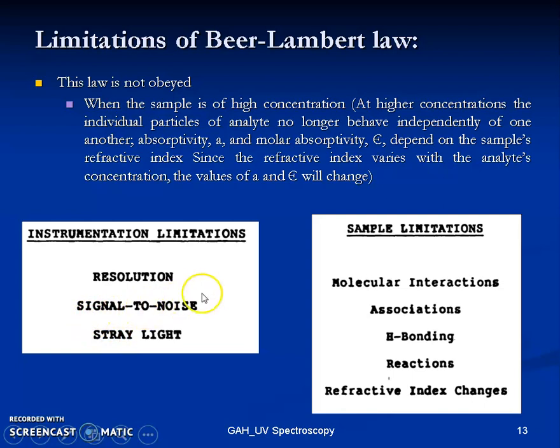Signal to noise ratio is one of the important concepts, wherein we need to differentiate the signal from the background noise. A certain ratio is fixed so that a signal can be taken out from the background noise, where a peak of sufficient height can be accounted as a signal.